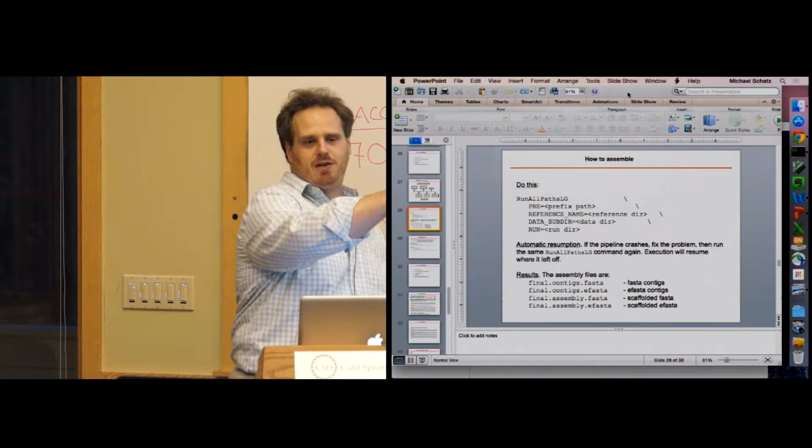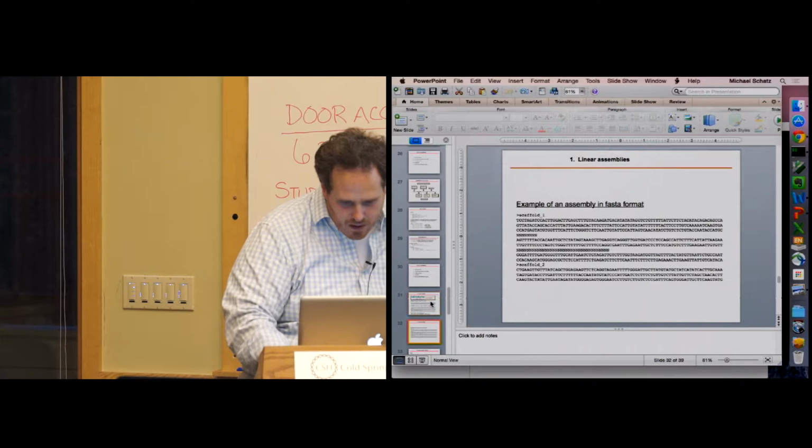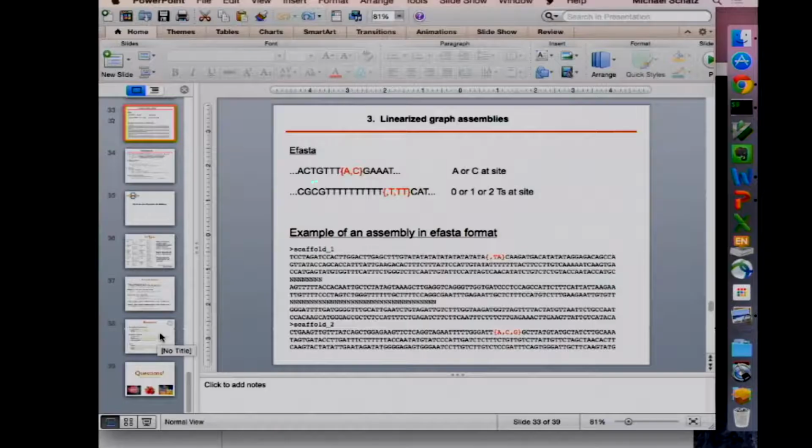The way this gets encoded is through these little braces. As we look in the eFASTA file, it'll be sequence, sequence, sequence, brace, A, comma, C. This means a heterozygous SNP. And then base, base, base, base, base. This is a very cool idea, to embed in your reference genome where the heterozygosity is. In practice, it sucks because there are no programs that know what an eFASTA file is. If you want to align against it, or BLAST it, or MUMmer it, it'll crash because it'll be like, here's a brace, I don't know what to do with that. So it's a very cool idea. A very active line of research right now is developing algorithms that know about these so-called reference graphs, where you can embed variants. The tools are quite primitive today, but I do expect to see more and more of this over time. Question?